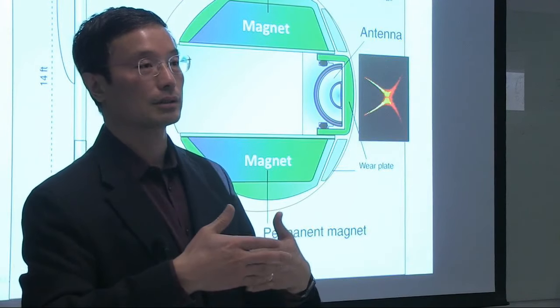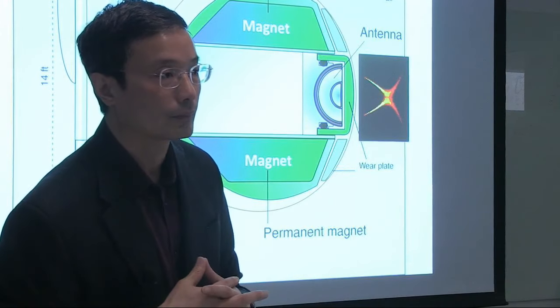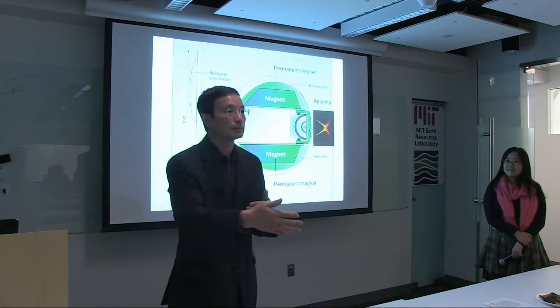That's why you can choose 1.5 inches and 4 inches. Compared to many other tools, when we say 1.5 inch or 4 inch, we mean a thin slice around that depth. It's not integrating from 0 to 4 inches. So that's one practical benefit of NMR: we know where the signal comes from.